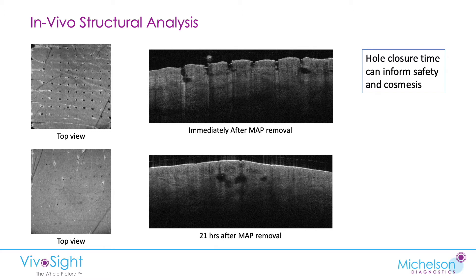We can also look at subsurface images. Immediately after removal, you can see that the microneedles have left holes in the skin — we can measure the depth of those, looking from the top view and the side view. 21 hours after the MAP has been removed, those pores have disappeared virtually; there are just tiny little indentations left. We can still see areas of fluid — pools of fluid in the dermis below where the microneedles were originally penetrated.